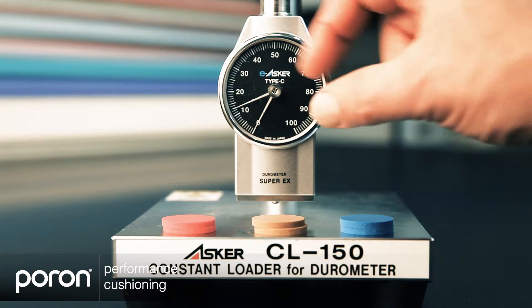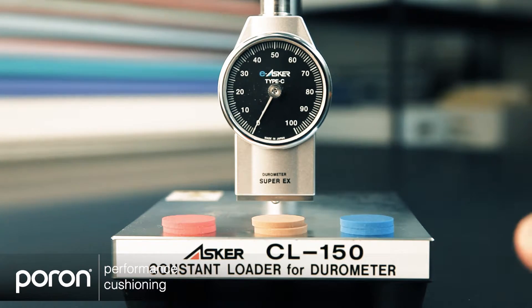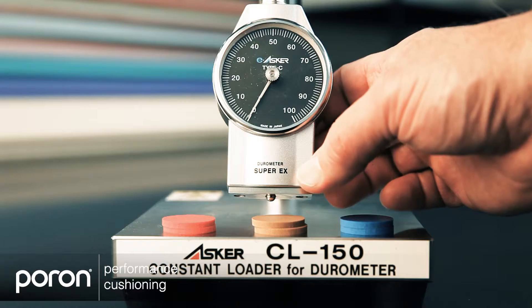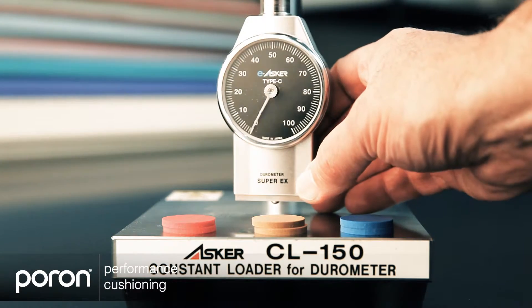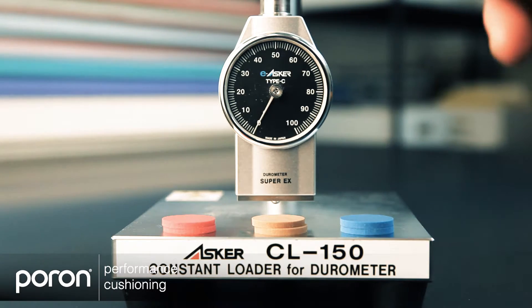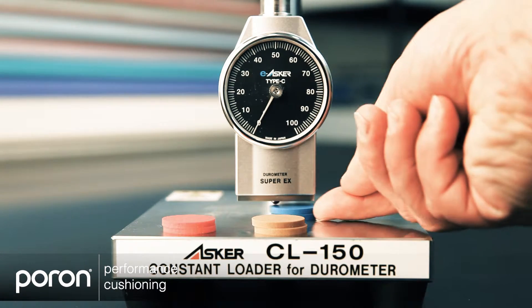This is an Asker C gauge, which we use to measure cushioning. It measures the firmness of the material. It has a hemispherical pin on the bottom that gets pressed into the material and registers how firm it is. This is on a constant loader, which will keep the rate at which it's being tested constant from sample to sample.